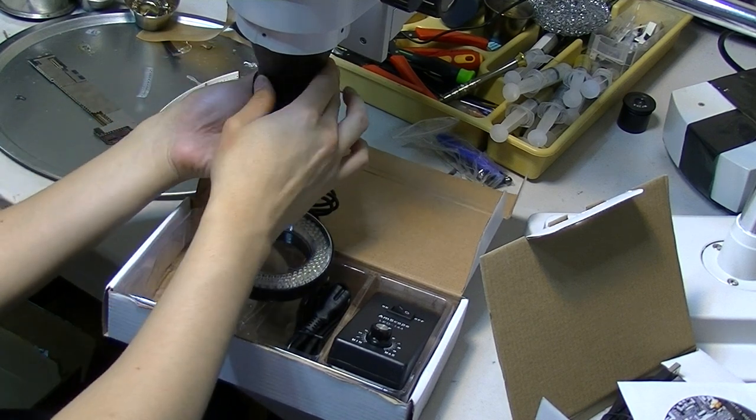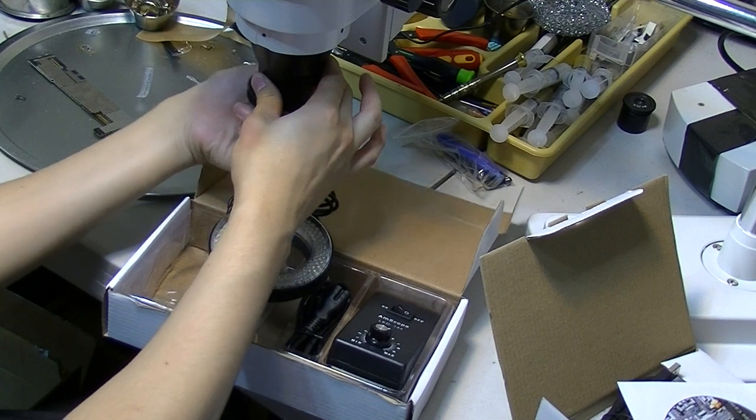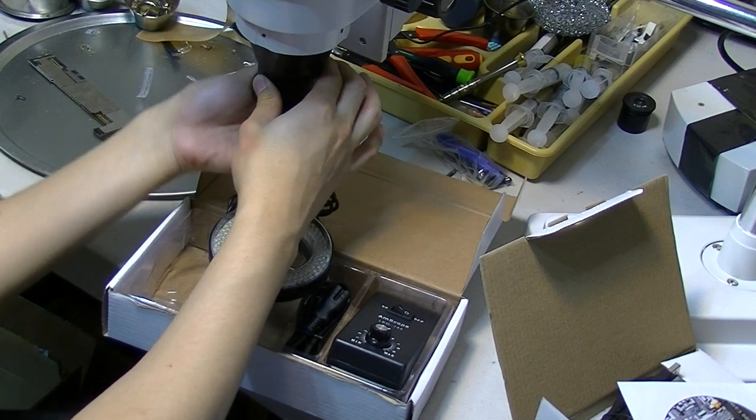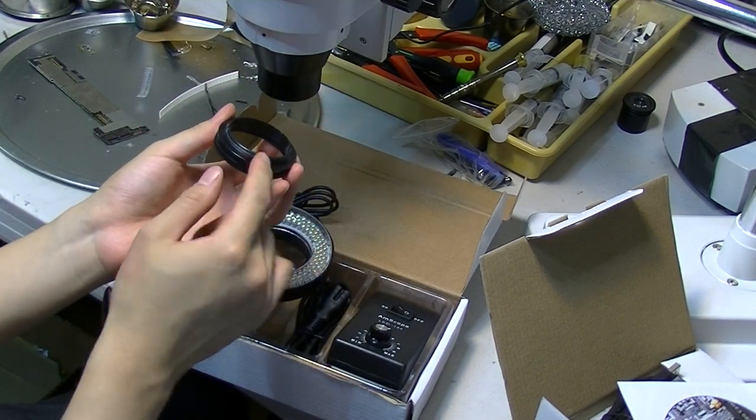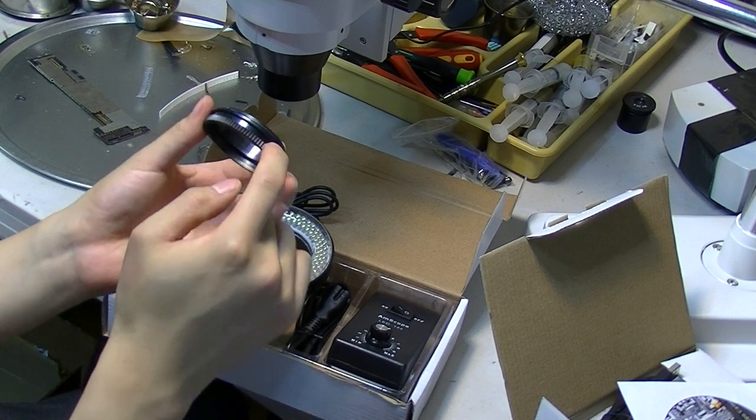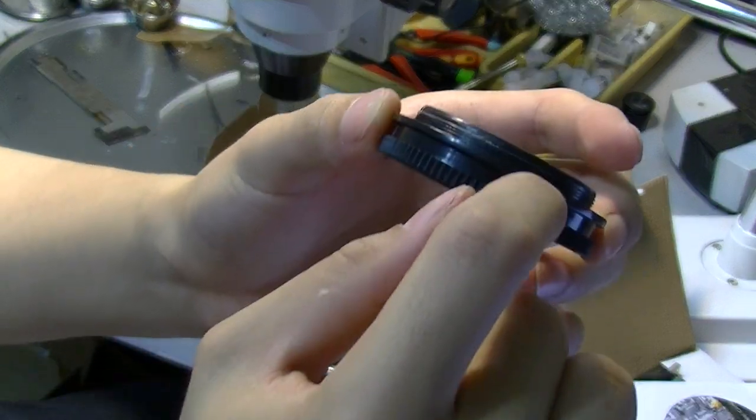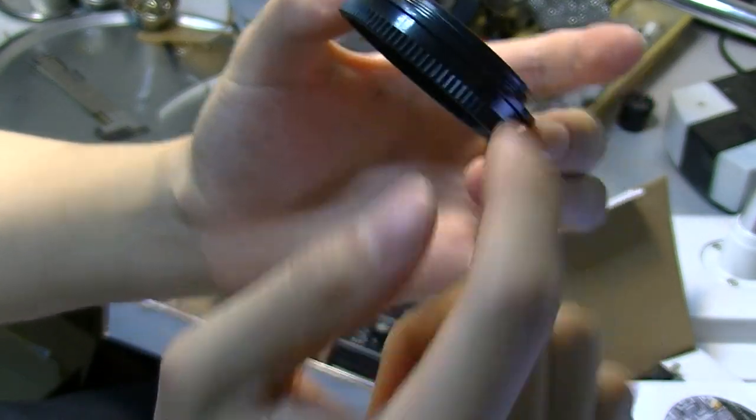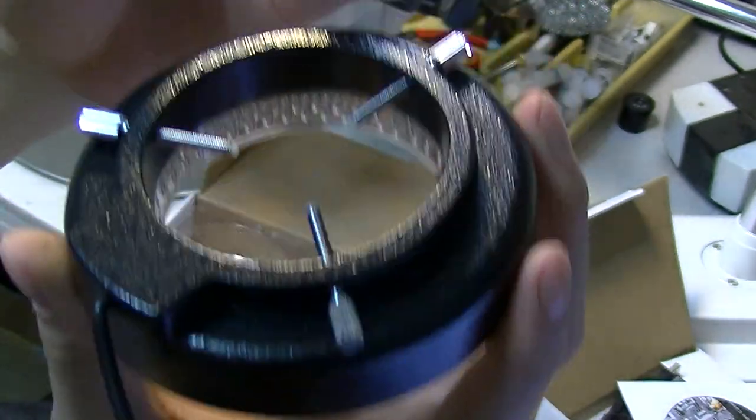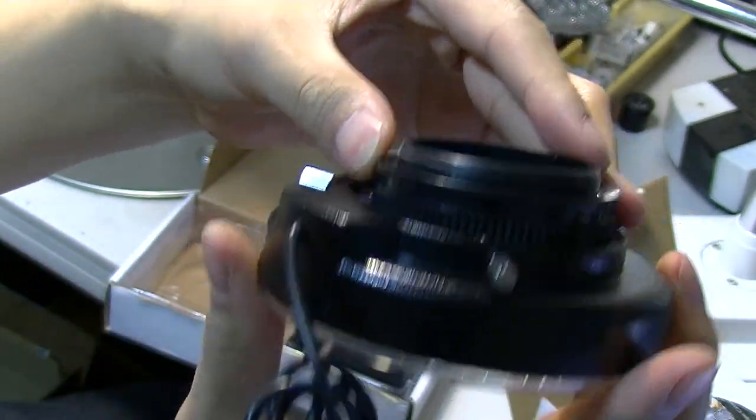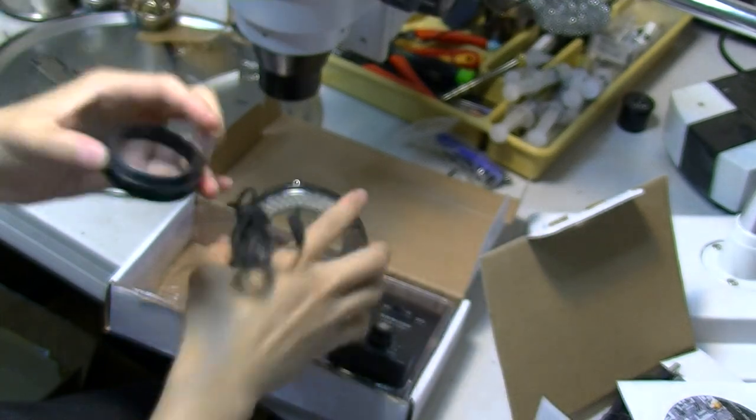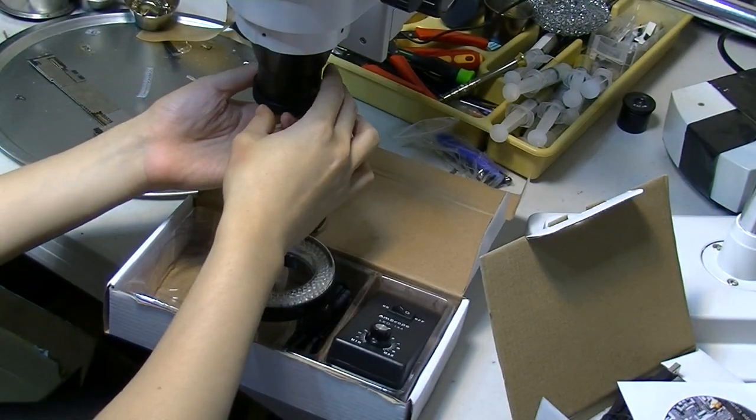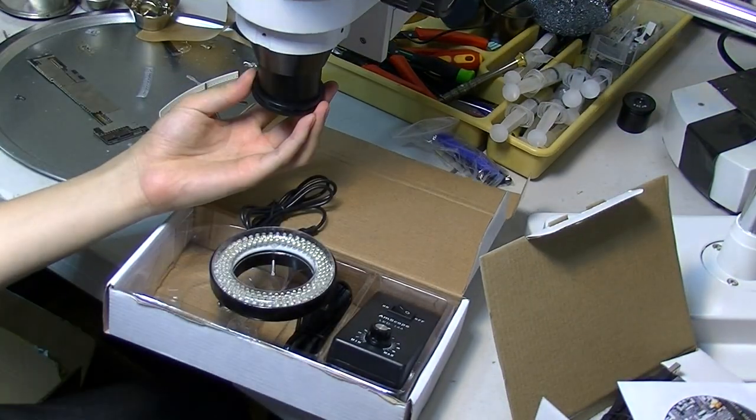Okay. So basically, this part goes on to the microscope and you see this groove. Let me just zoom in here. The groove over here, that's where this screw is going to be holding on to this part. Okay. Let's get the lighting.